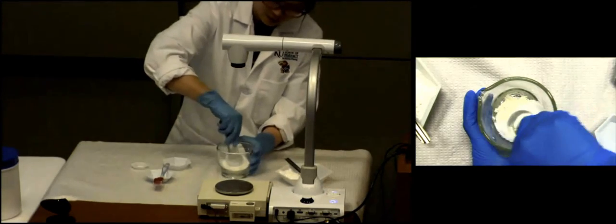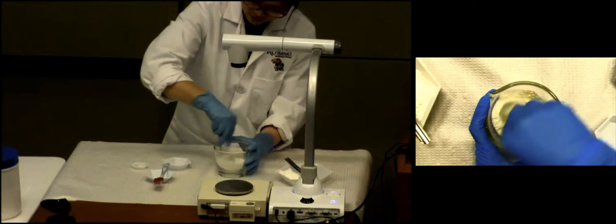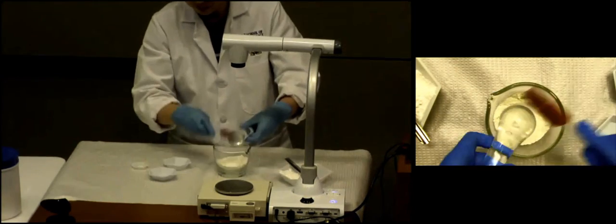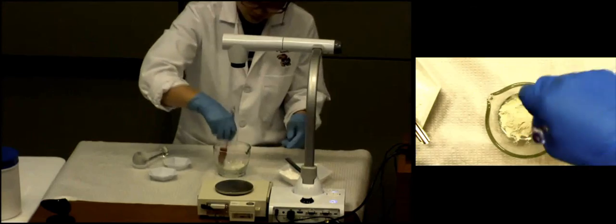We watched Judy do this, which is very fascinating. Let's look at step 4 of your procedure, though. There is something I want to make sure of, because everyone will lose some points during the semester with step 4, because this step is the same for all of the different dosage forms. It will say to transfer a certain amount of the product into a certain container. There are 3 things in that line that I will take off points for if they're missing.